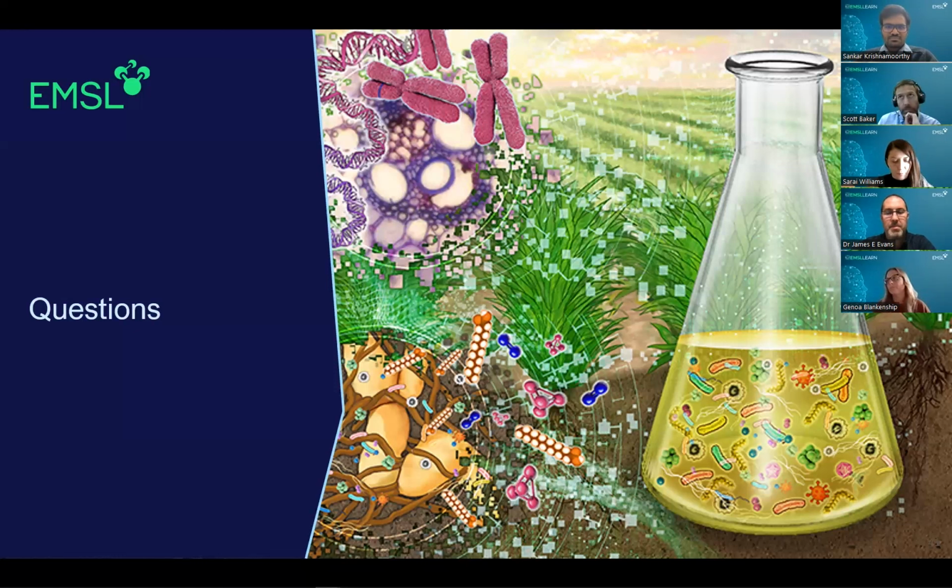Okay, so we do our own sample prep, which is isolated using our nanoPOTs robot. The sample prep will be done here, and the users can be with us while we do the sample prep, but we don't recommend them doing their own sample prep. However, if they are isolating their own cells, they could send a frozen tissue, and we can do the cryosectioning for them, and we could do the LCM and our bottom-up pipeline, which I showed in the presentation. And if you have more questions about our sample prep, I can send our previous manuscripts.